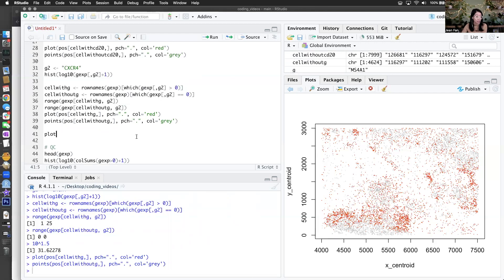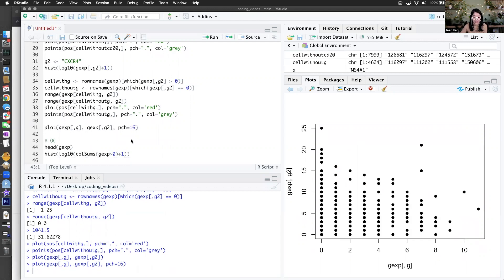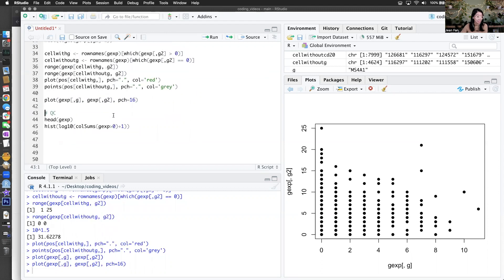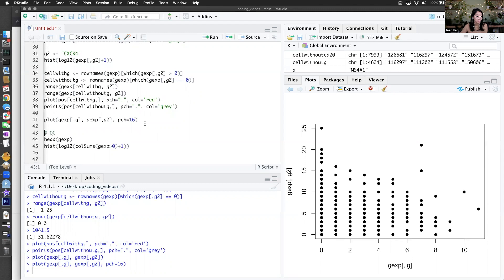Then if I plot the gene expression of MS4A1 versus the new gene CXCR4 — is there a population that has both? I'm going to make them circles. There are some cells that only express CXCR4, so they have 0 of MS4A1. And then there are other cells that express 0 of CXCR4. And other cells that are positive in both. So we can do this type of exploration and find our double positive cells.